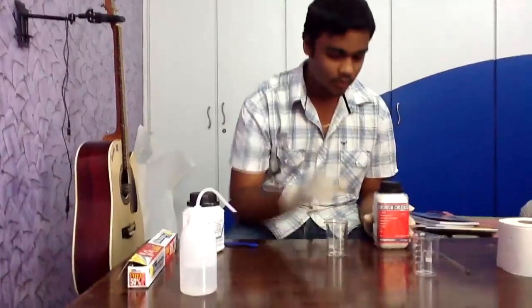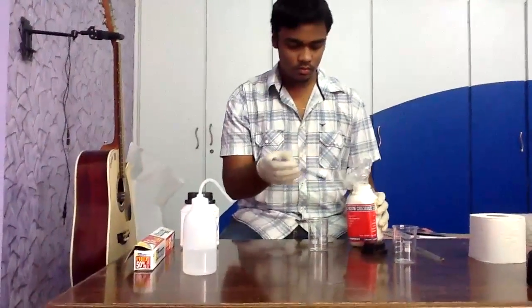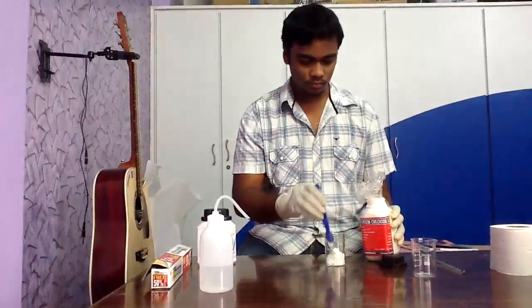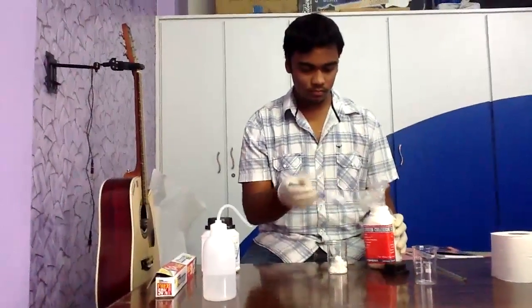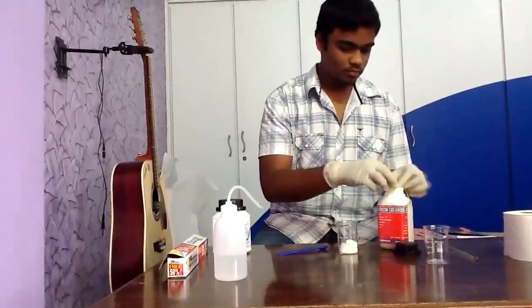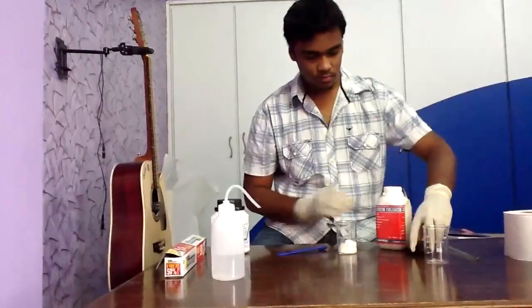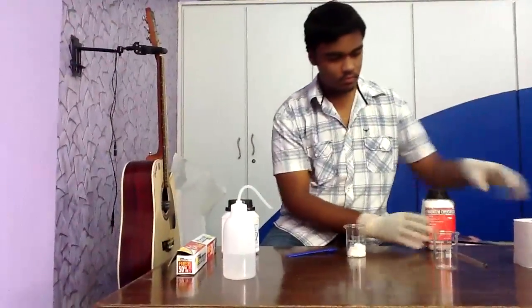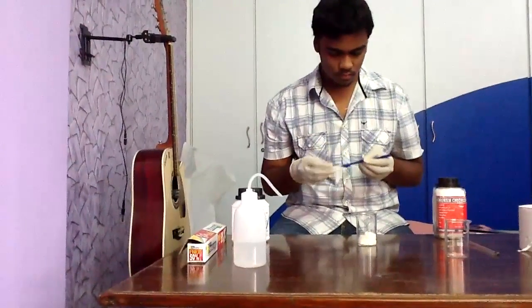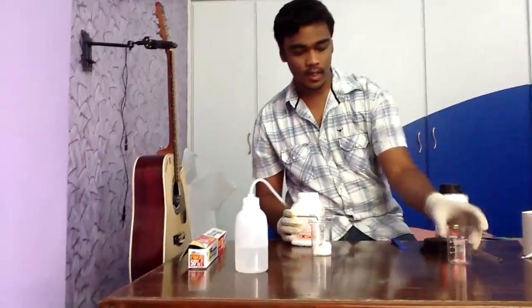Now let's take some of the base and acid. I am taking some barium hydroxide. Let's take a look.